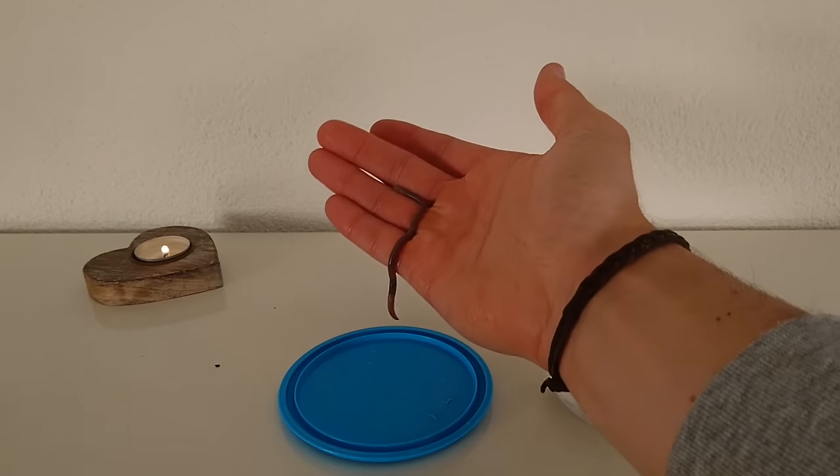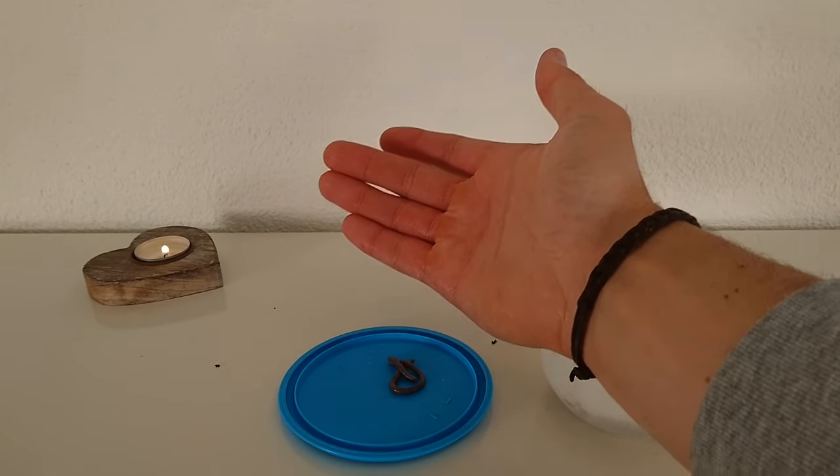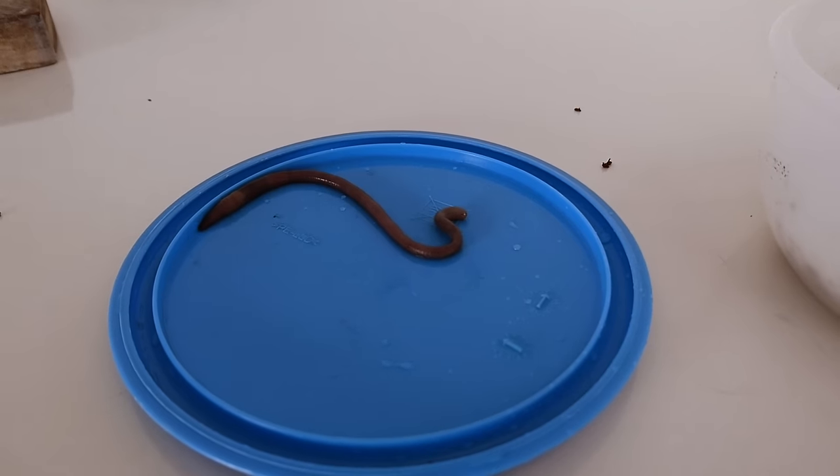So now this rainworm that I found close to my backyard is clean from any dirt and it's ready to see under the microscope.